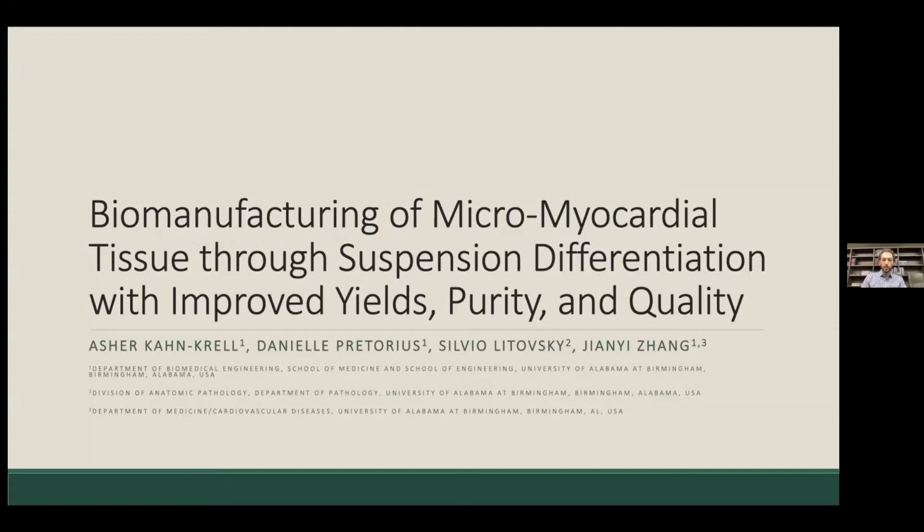Today I'll be sharing some of the work we've been doing on biomanufacturing of micromyocardial tissues or organoids through suspension differentiation, and looking at the improved yield, purity, and quality of these biomanufactured tissues.